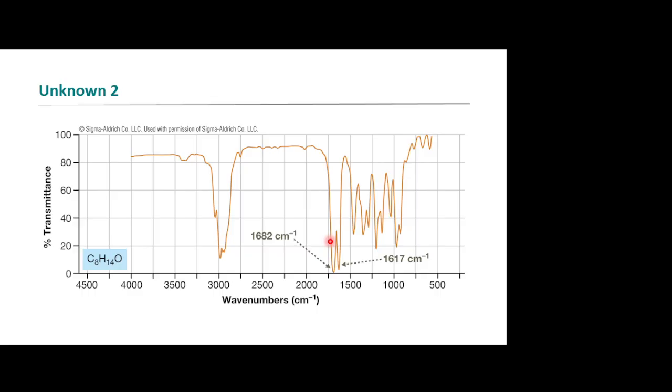Can we have any of those other ones? No oxygen, no nitrogen to add to those, right? So it has to be a ketone or aldehyde, doesn't it? Okay, so what is the range for the ketones and aldehydes? 1680 to 1750. Yep. You're starting at the lower number.